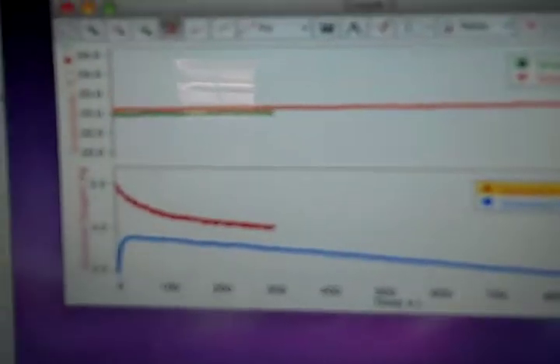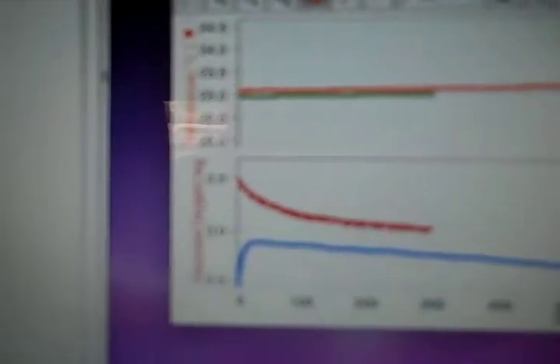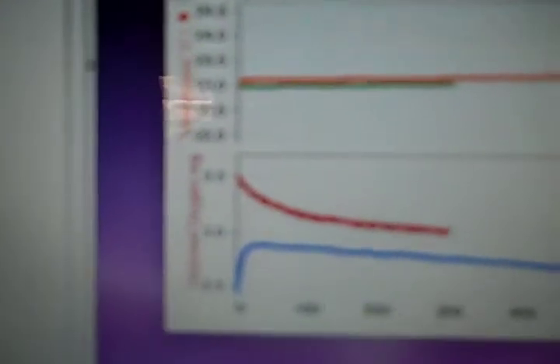Our predictions for this lab are that under a controlled environment, the dissolved oxygen levels will remain constant. Once we add the Elodia, though, it will remain constant for a while and then drop significantly. As we can see, originally the Elodia affected the levels because it significantly reduced the amount of dissolved oxygen. When we started the stir bar up again, it rose significantly.